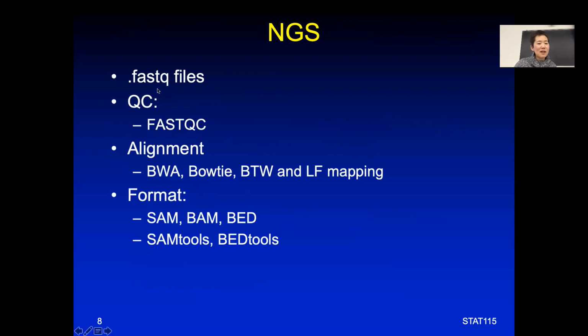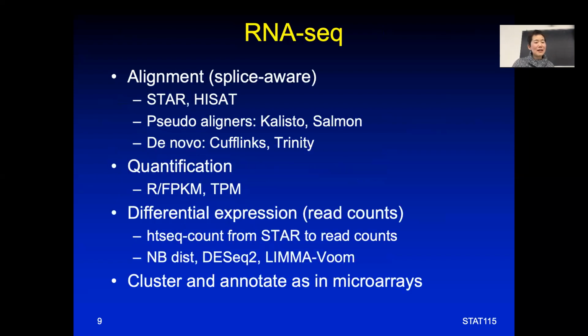And then initially when high-throughput sequencing was starting, CS people really jumped on because there's a lot of data. You have to do the read mapping, alignment, find the location, look at the differences. These are all CS. FastQC is actually pretty simple, you just display, but BWA, Bowtie, BAM, these are all CS algorithms. I would say STAR is more CS as well. But once you align the sequence to a gene, now you have an expression index, you try to calculate differences.